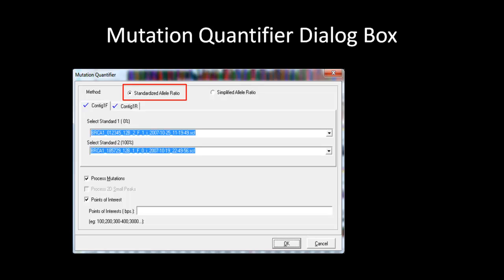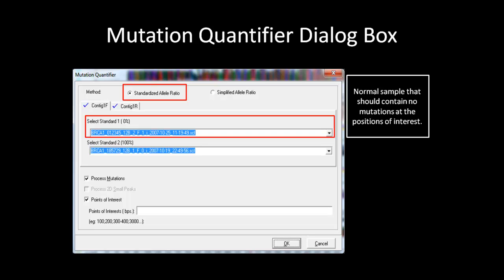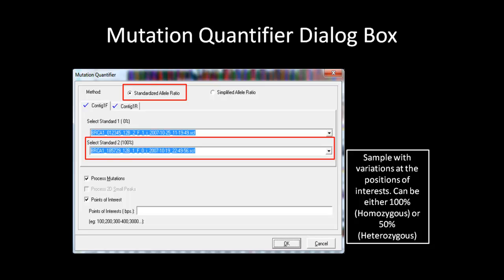The first topic that we will discuss is the Standardized Allele Ratio Method. For this method to work, you will need to have standard samples. The first standard at 0% is the sample file that is your normal — this should be the reference sample that contains all the positions of interest with no variation at those positions. The second standard will be the sample that contains variation at the position of interest, either homozygous or heterozygous. The default is set to 100%, which is homozygous, but you can change it to 50% for heterozygous mutations. If you do not define your standards, the software will automatically pick the best standard for each contact. However, if you have fewer than 3 samples per contact, you might want to consider defining the standards for a better quantification.